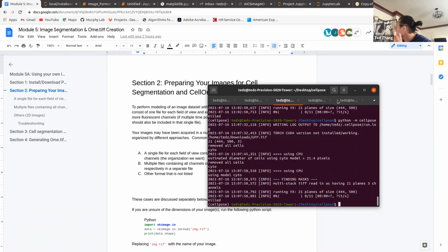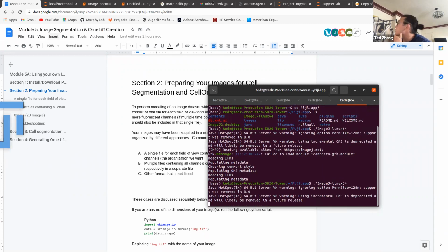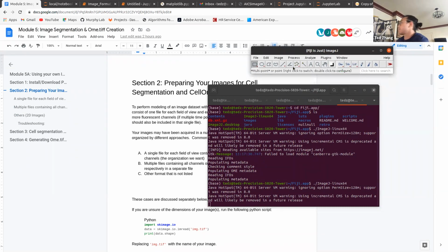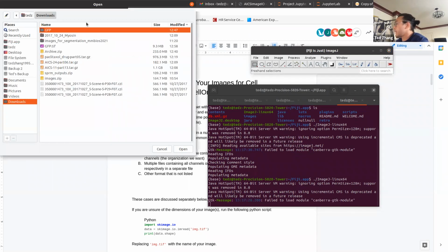Give me a second. Let me try to open up Fiji. There we go. There it is. So let me share. Actually, is there a way to just share my desktop? Oh, there is. Okay, great. So it's perfect because I'll do that, so then I don't have to change between views. So this is ImageJ right here. The GUI is not super intensive, but let's open up a file that we're interested in.